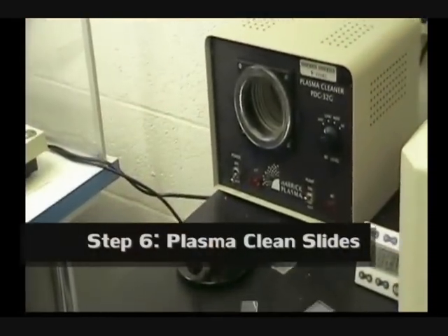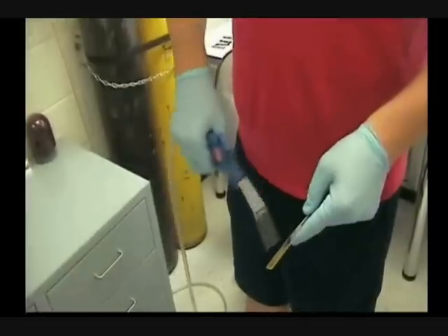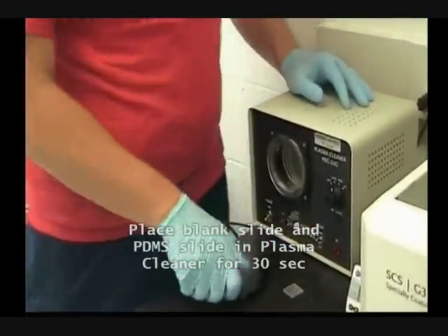And I am gonna place one more clean glass, and I am gonna place it here. And I am gonna run plasma treatment for 30 seconds.